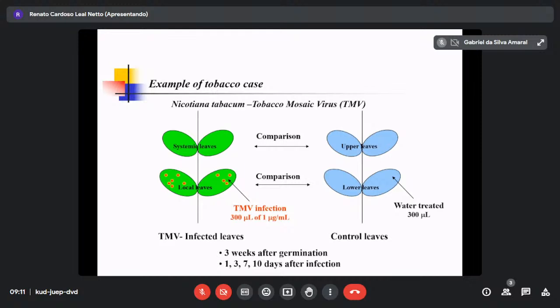What's the way? Average, or median value. One of the easiest ways is that for the missing value, I calculate the median value and add it.